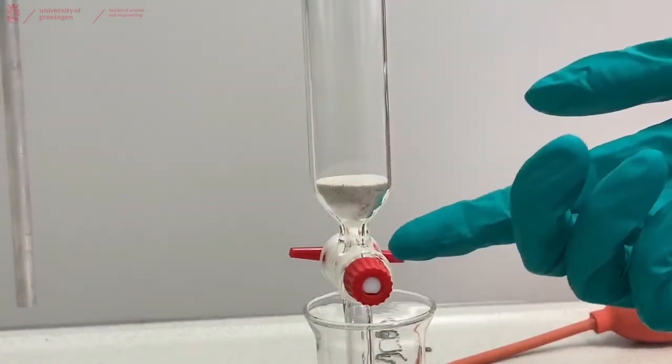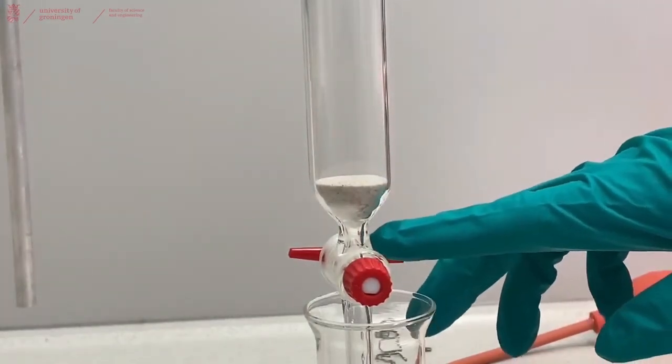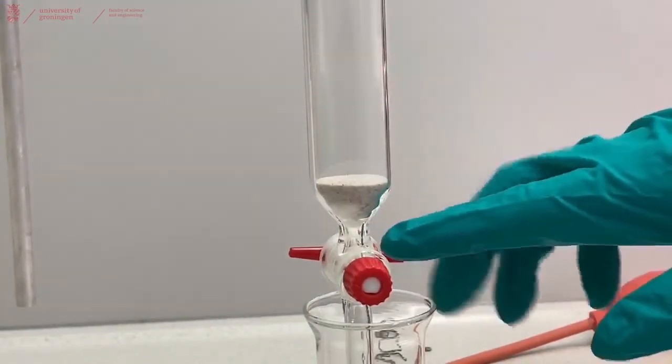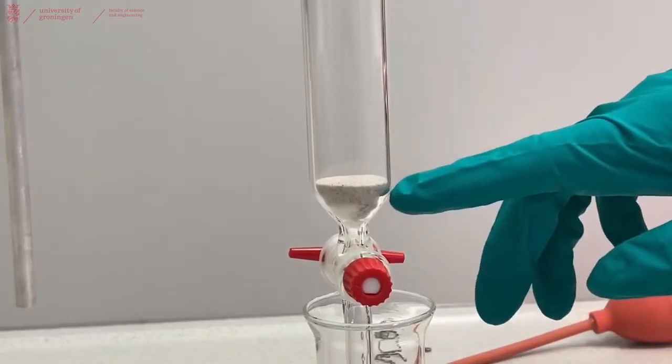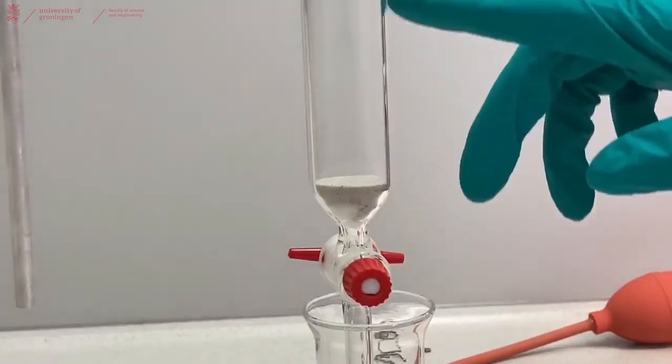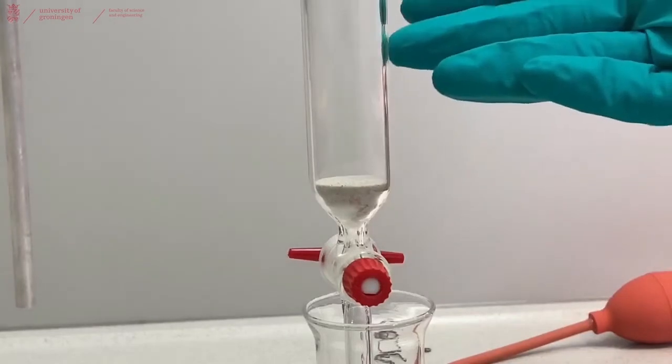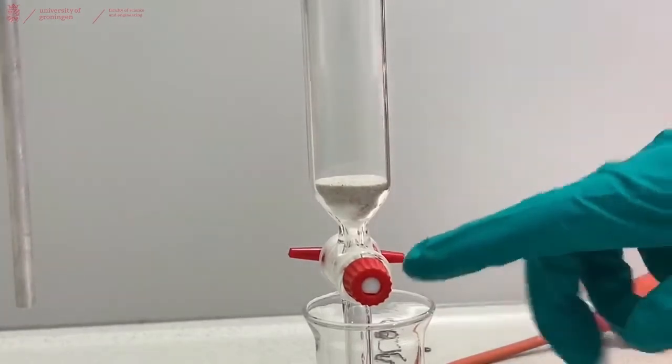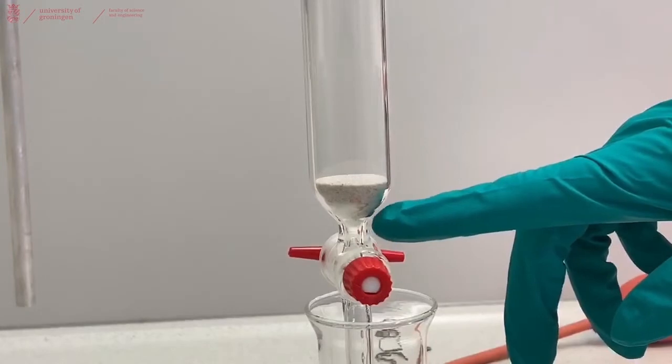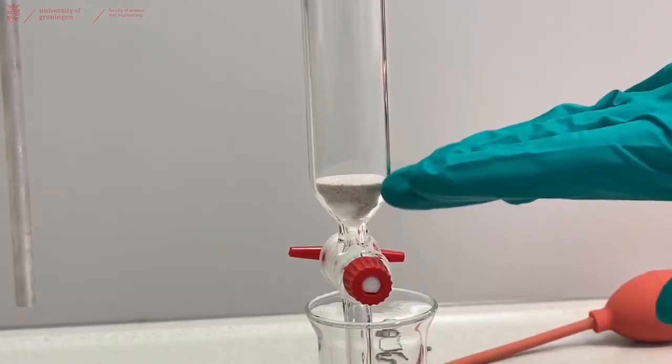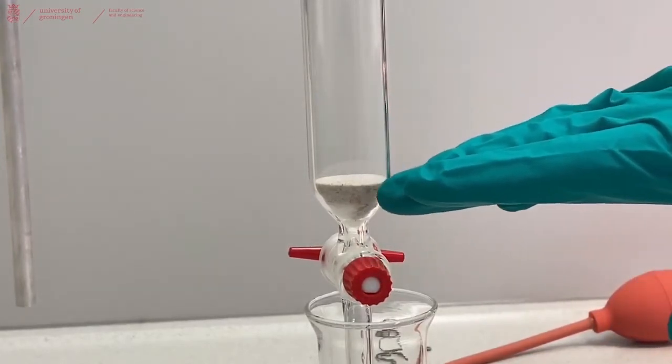At the bottom of the column, we placed a tiny bit of cotton pressed down with a long rod. And this is to prevent any of the sand or the silica that we're going to place in here, or any other solid phase that you're going to place in here, from leaking out the bottom of your column. And above the cotton, we have a layer of sand to have a nice equal bottom layer of your column.